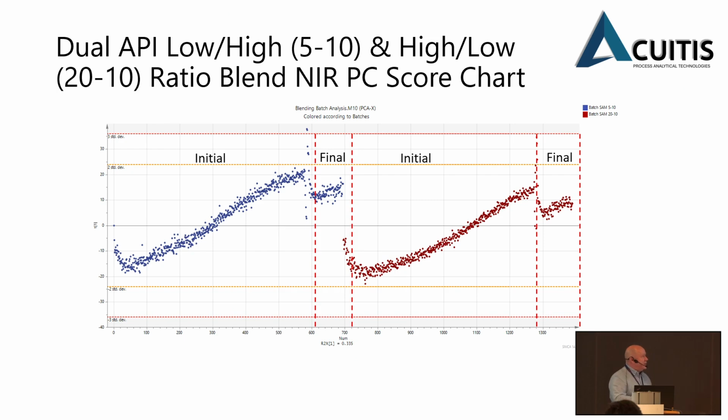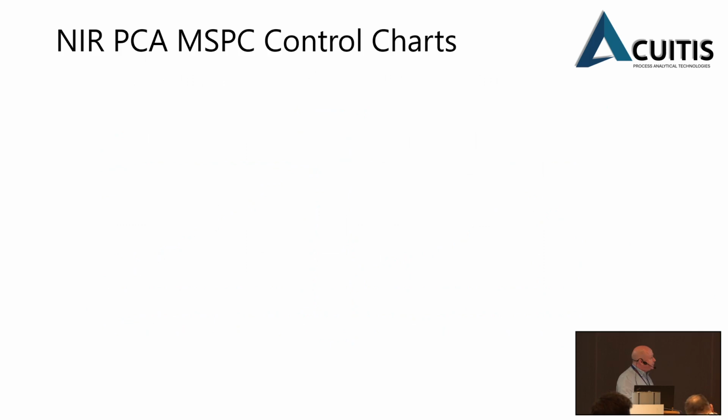So here's another example of somebody stressing their equipment. Here we see a blend profile that's not typical of what we would like to see, which is a nice sort of second order mixing profile. Here we've got what's called diffusive mixing, and it's a lot slower process and causes problems. So quite clearly you see these blends are not reaching the final endpoint and are pretty poor.